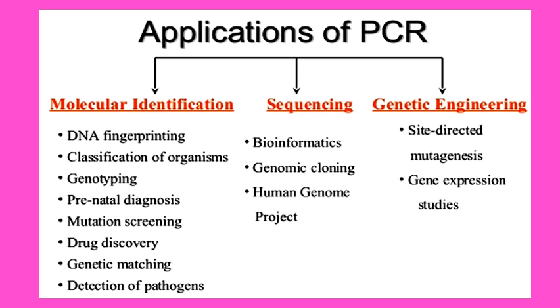Now we reach the most important part, which is the applications of PCR. As you see here, these applications involve several uses of this important device. The PCR technique may be used in molecular identification, sequencing, and genetic engineering.